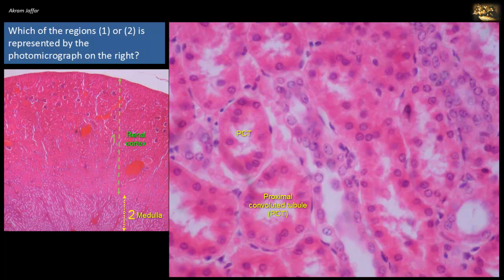You can compare the cytoplasmic stain of the proximal convoluted tubule with that of the nearby distal convoluted tubule. In addition to the proximal convoluted tubule, the photomicrograph on the right shows few profiles of the distal convoluted tubule, which do not show a brush border, thus resulting in larger and more clearly defined lumen. The distal convoluted tubule has less affinity to cytoplasmic stains due to a smaller content of organelles, so they appear lighter than the proximal convoluted tubule.